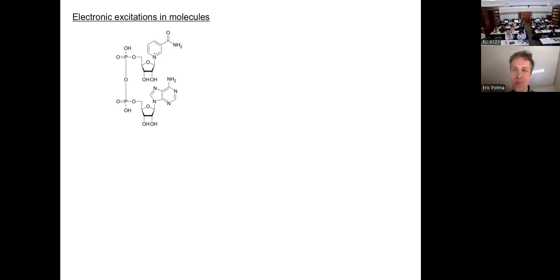Yes. The nonlinear light types on the previous slide, SHG, THG, SFG, those different types, are those the types that we talked about when we were doing P1, P2, P3? Yeah, so I will highlight some of that in the following. For these 3 examples that I showed you, I will tell you what order they are, and so which nonlinear susceptibility is responsible for the response, and also how that relates to the molecular response. So what does the molecule do to produce a signal like that?